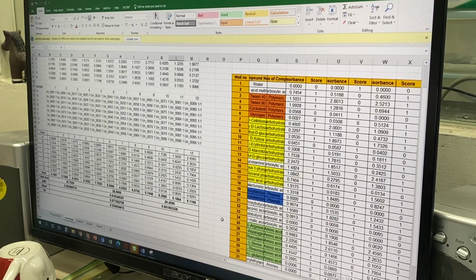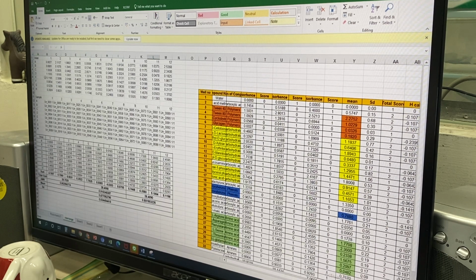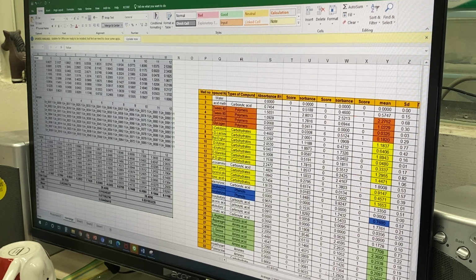You just calculate this one, right? You can calculate up to this one, right? Because I already told you how to do. And then you have to calculate that. It's 96 things. So you can see that these are the different kinds of carbon source.